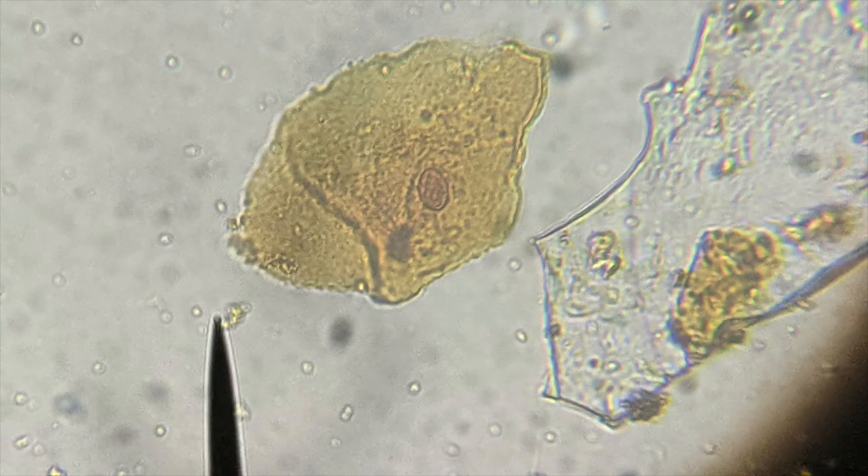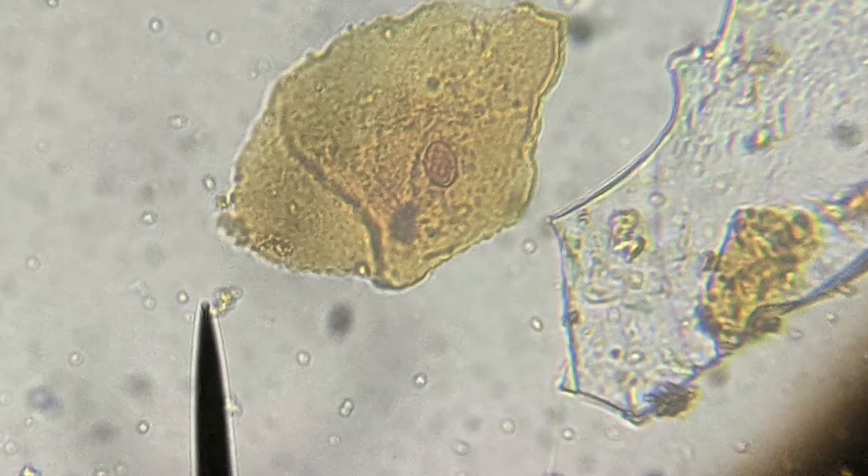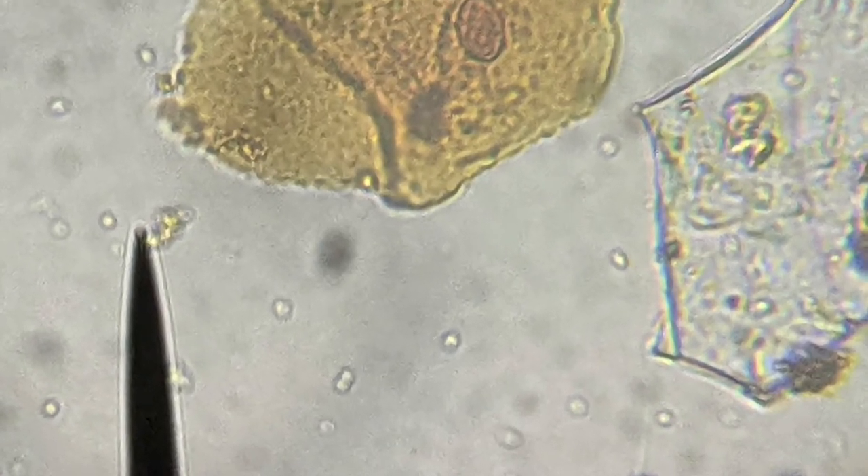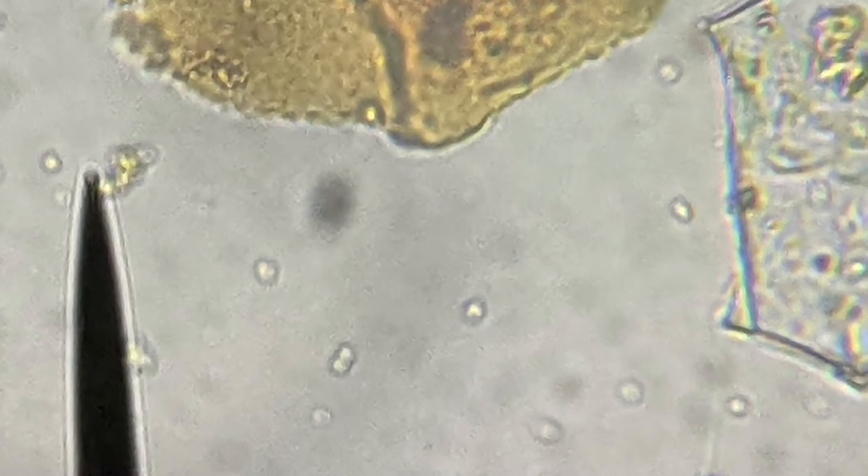With a smear of live culture yogurt and cheek cells placed in the open spaces on the smear, also stained by iodine, we can compare prokaryotic cell size to eukaryotic cell size of both animal and plant cells.